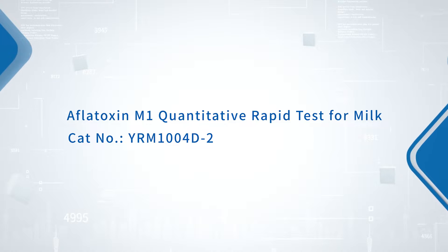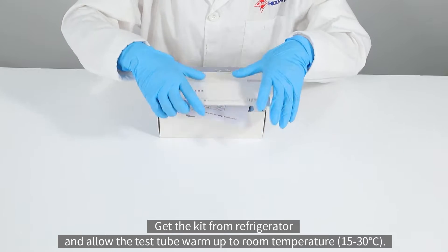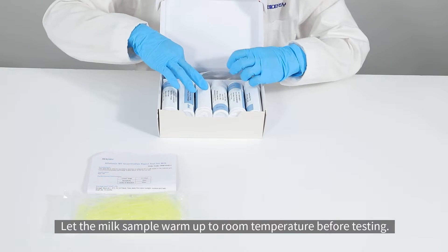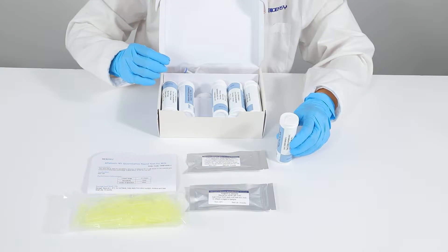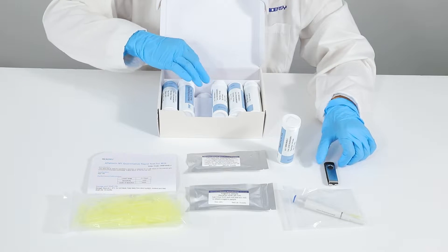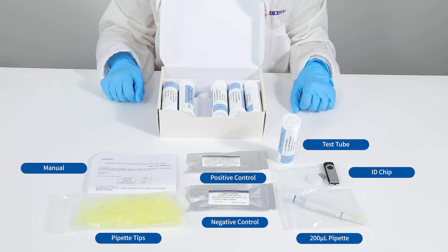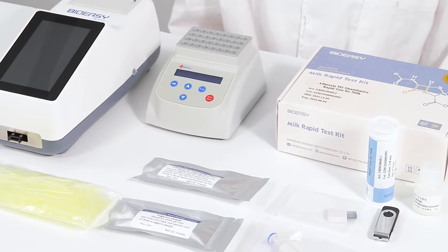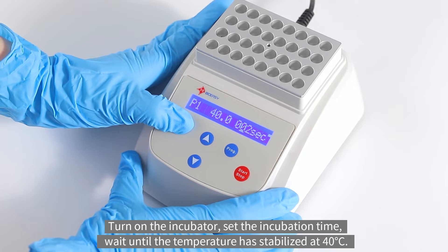Aflatoxin M1 quantitative rapid test for milk. Test preparation: get the kit from the refrigerator and allow the test kit to warm up to room temperature. Let the milk sample warm up to room temperature before testing. Turn on the incubator, set the incubation time, and wait until the temperature has stabilized at 40 degrees Celsius.